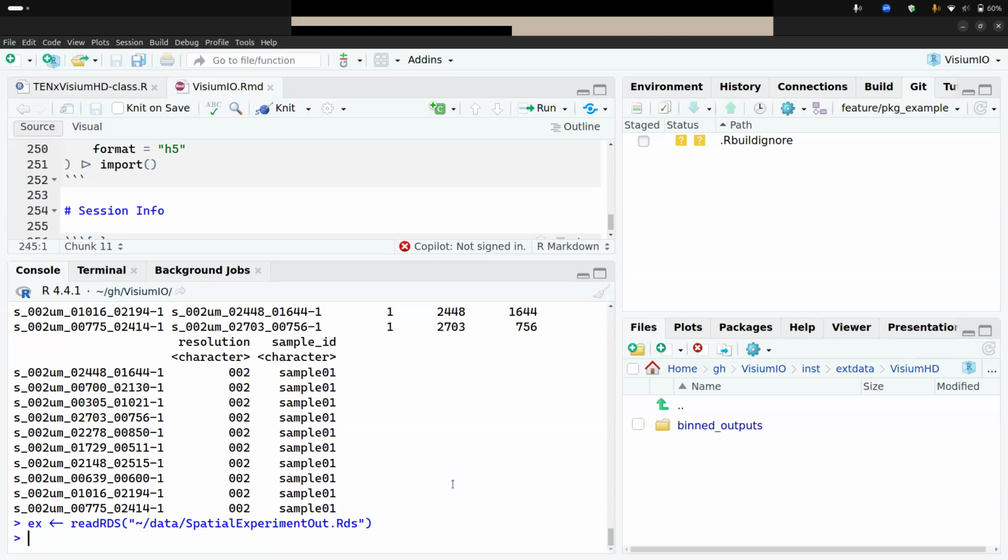I don't know if it works out of the box, or what kind of format they're using.